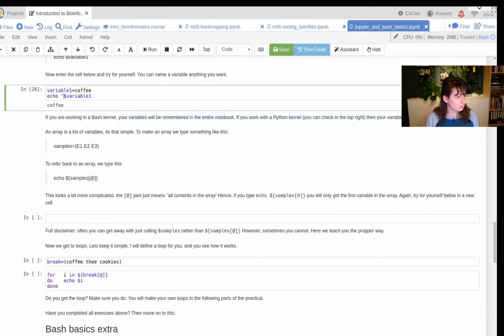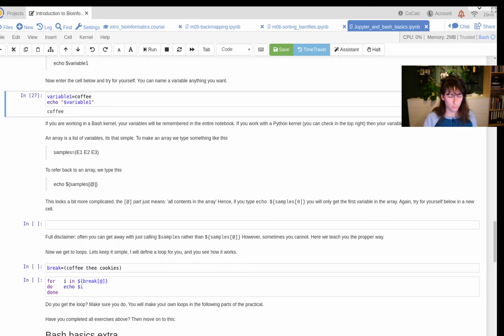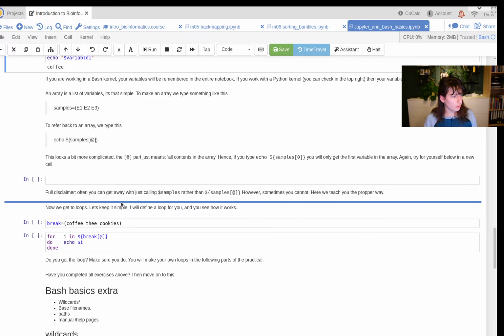By the way, some bash purist now is saying you have to do it with double quotes. Officially you have to do this with double quotes, but usually it works without. Moving on. A variable has a certain name, and you can put something in there. It could be a number or a word, but it's always one.